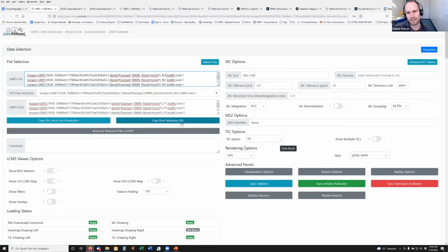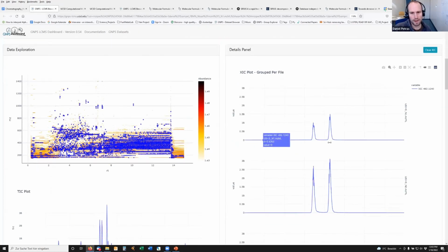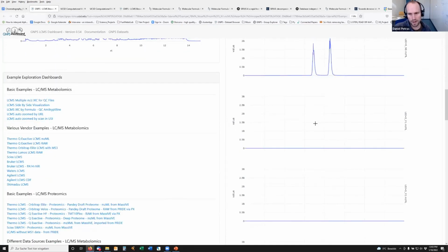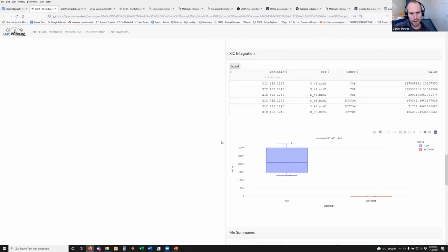And this theoretically should not produce Yersinia bactin. So now, very nicely within the dashboard, if we load multiple files, we can already do some peak extraction and actually get peak areas. Well, first we can compare them, of course. So here we see there's those peaks, and then here in our knockout, there's none. And then if we scroll through to the bottom, we can directly see this visualized here, this box plot. And we had still doubts that this molecule was Yersinia bactin. The latest now was the knockout mutant.